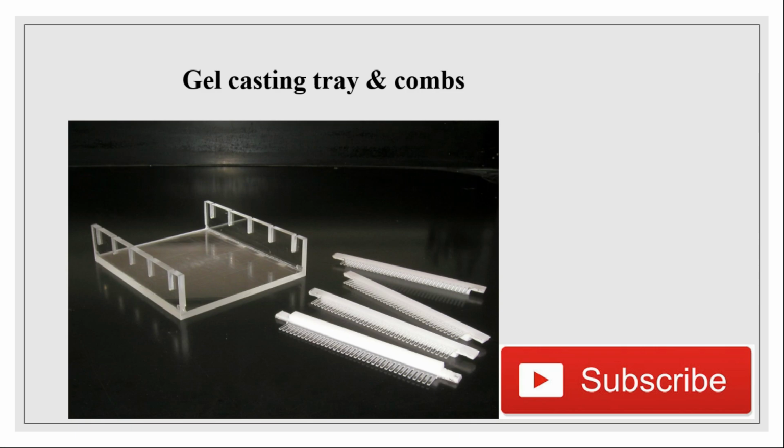Next you can see the gel casting tray and combs. While preparing the agarose gel, we can prepare the casting tray and put the comb inside. How many combs we need depends on whether we have 10, 12, 20 or more DNA samples, so we can prepare the casting tray accordingly, because some instruments are specific, smaller or bigger, depending on the size of the gel casting trays and combs available in the market.